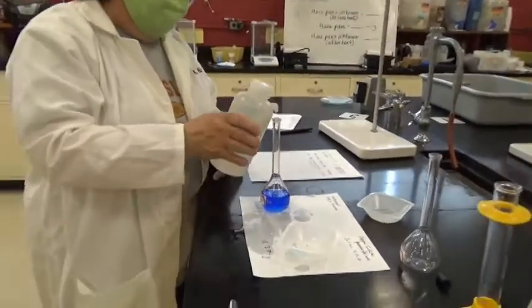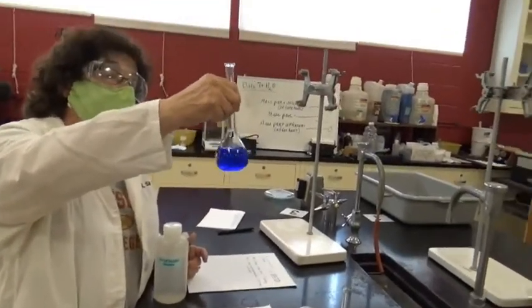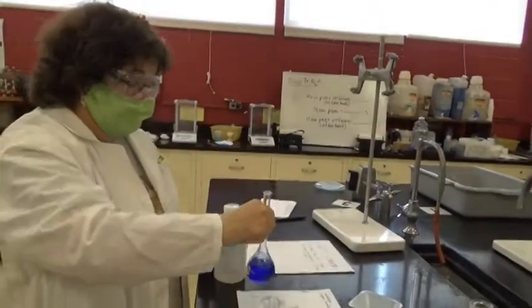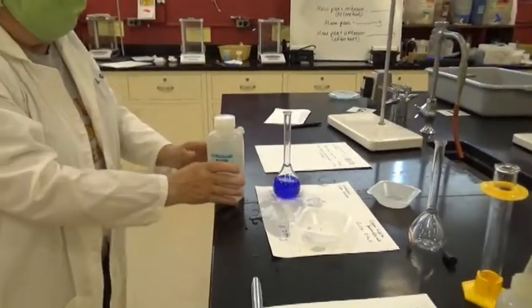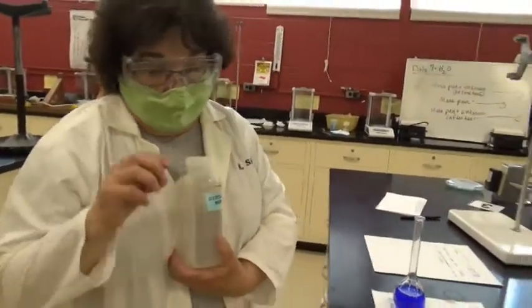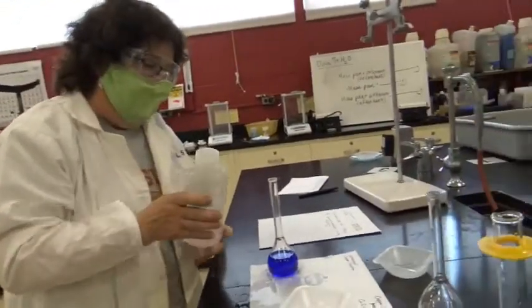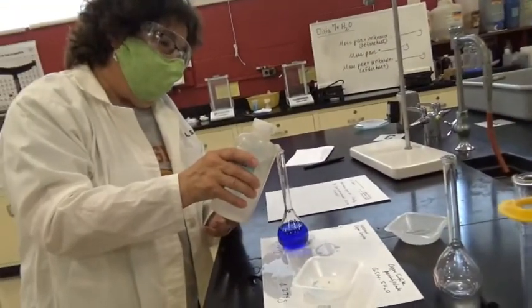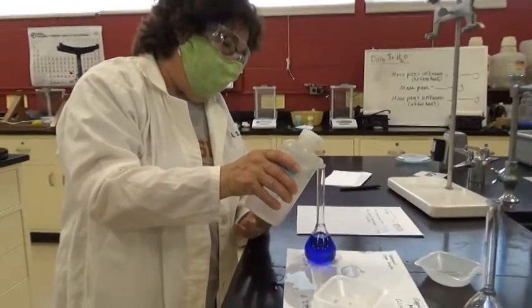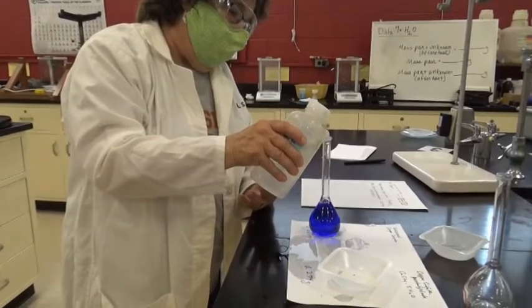So now I'm going to add a little bit more water, and I'm going to swirl it around a little bit. I'll look for solids on the bottom. It looks pretty good. And I'm going to add water up to the top. Now, this is nice, but one little slip and too much water, I've got to throw this away and start again. So I'll add a bit here until I get close to the neck. And be very careful.